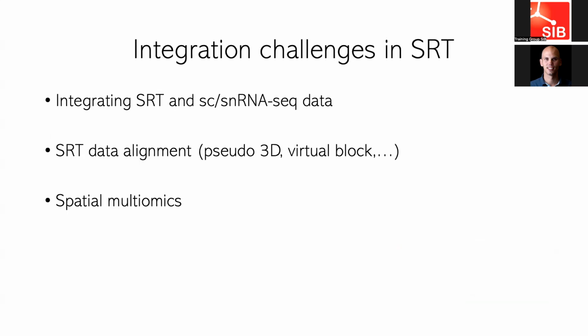So I thought a bit about integration, and I would like to talk a bit about single cell and spatial data integration. What can we do with that? And what are the different approaches and methods? A bit on alignment. I mentioned briefly batch correction, but that doesn't take any space into account. Alignment can be of consecutive sections, and you can see it as a way of doing batch correction. And finally, very briefly on multi-omics, if we have multiple measurements of different technologies.